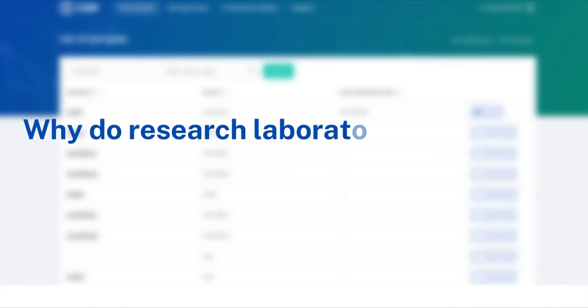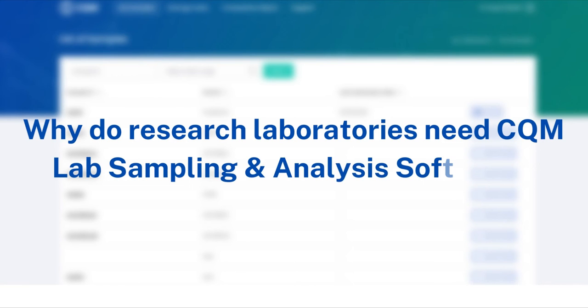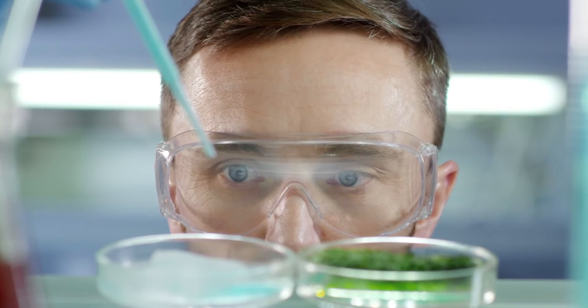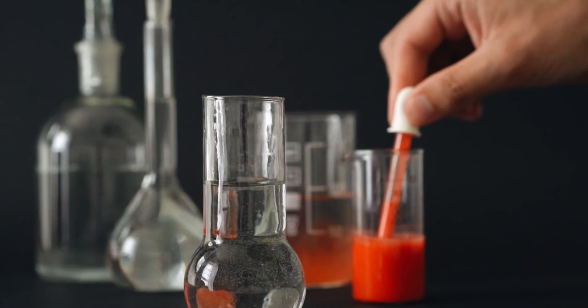Why do research laboratories need CQM lab sampling and analysis software? Research laboratories like Solomon Park Research Laboratories, Inc. have devoted themselves to improving the quality and accuracy of test results.